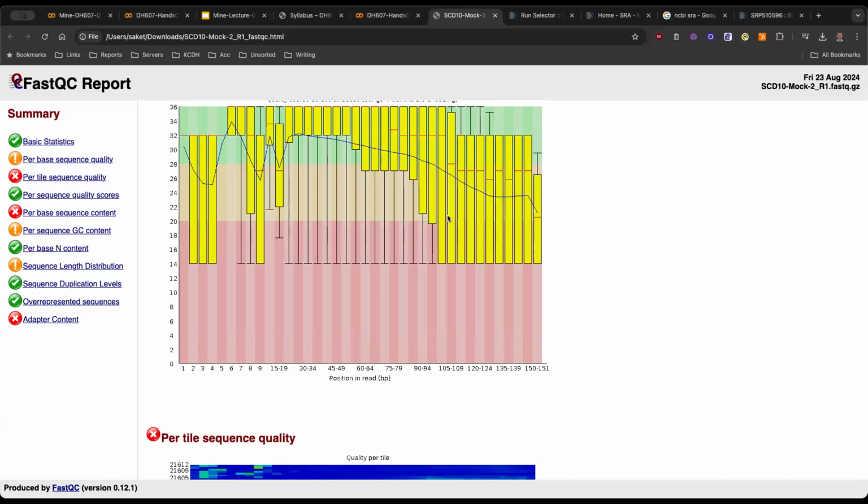And when the incorporation happens, there is a camera sitting at the top, which is going to record what the sequence looks like. It will record a T. And then it's going to wait there. Why is it waiting there? Why is the camera going to wait there? Or once you get one base, why do you have to wait? This we discussed in the class.